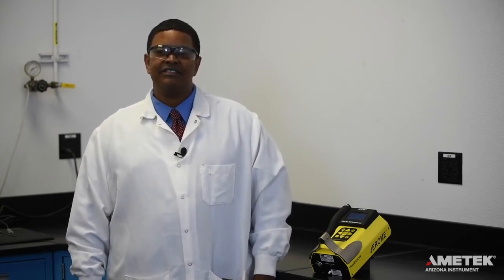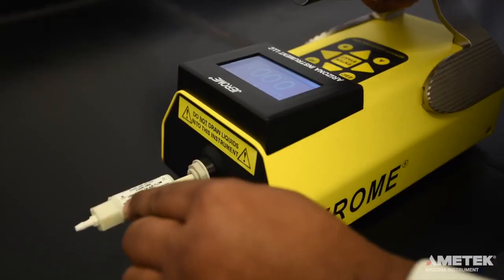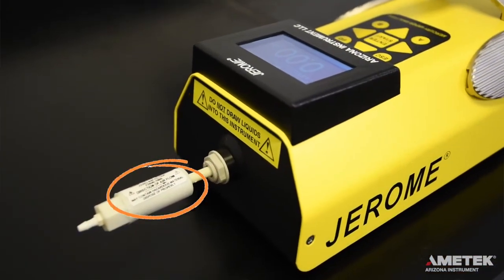To perform the clean air system check, insert the zero air filter into the intake port located on the front of your J405, so that the arrow on the label is pointing towards the instrument. Once inserted, take five samples, waiting 15 seconds between each, to maximize sample accuracy and allow the sensor to re-stabilize.